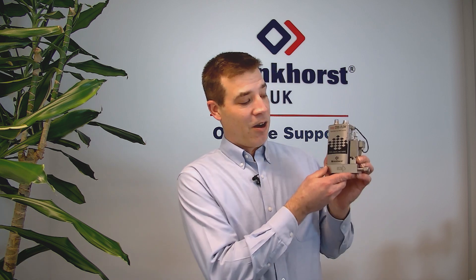Hi, it's Adam from Bronkhorst and in today's video we're going to be looking at our Coriolis range of mass flow meters and controllers.